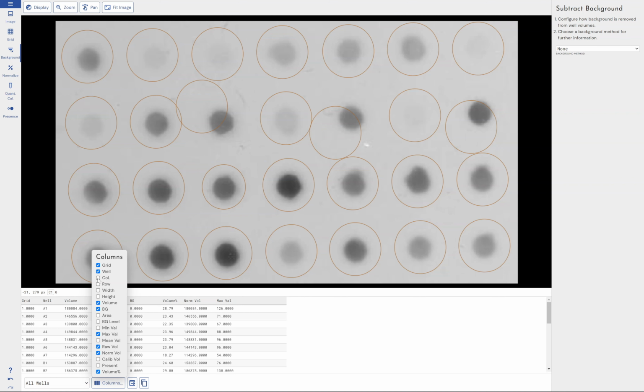Now, it's really important that people investigate this column section because they might think that the software is unable to perform these measurements, and it's simply that we don't have them all turned on all the time. That's because we don't want to clutter up this area with data that we don't know that the user wants to pay attention to or cares about.